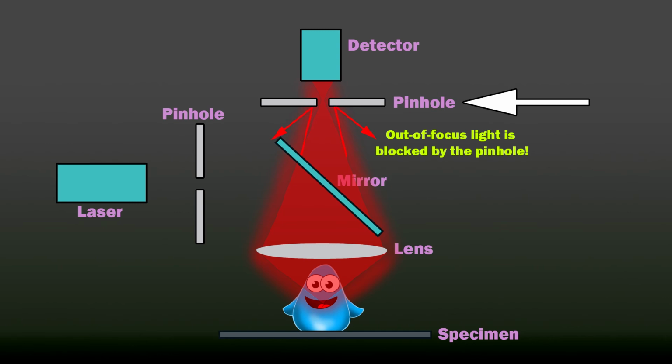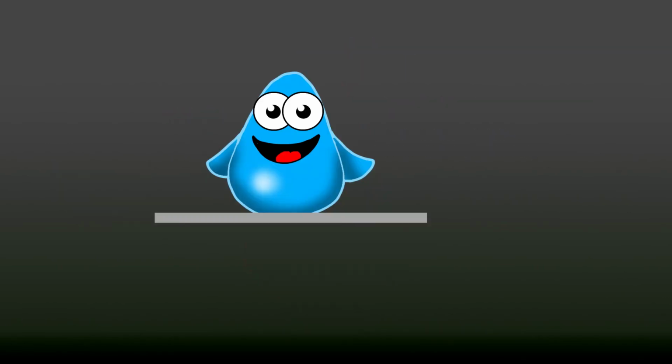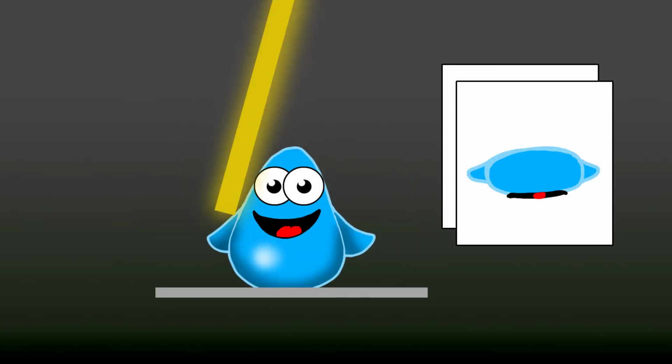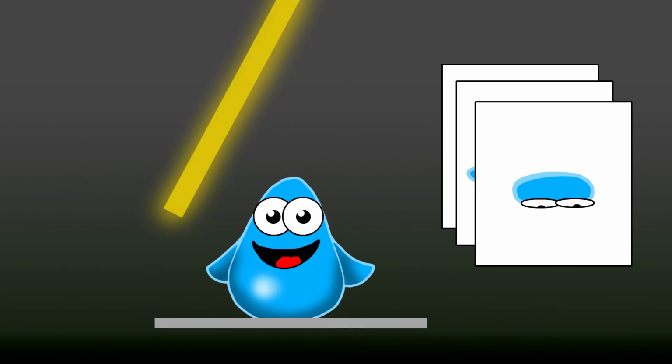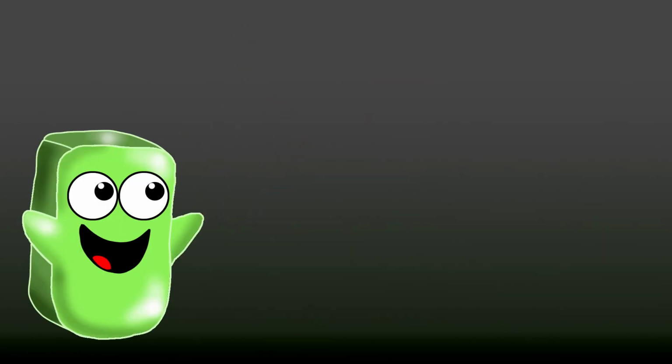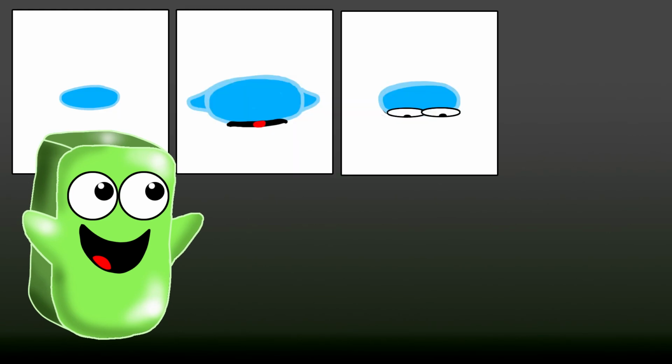To get 3D information, you use the lasers on the confocal to scan at different depths within the sample. The pinhole only collects the in-focus light at each of those depths, so each image shows a different part of the 3D structure. When you put this stack of images together, you can see the whole sample in 3D.